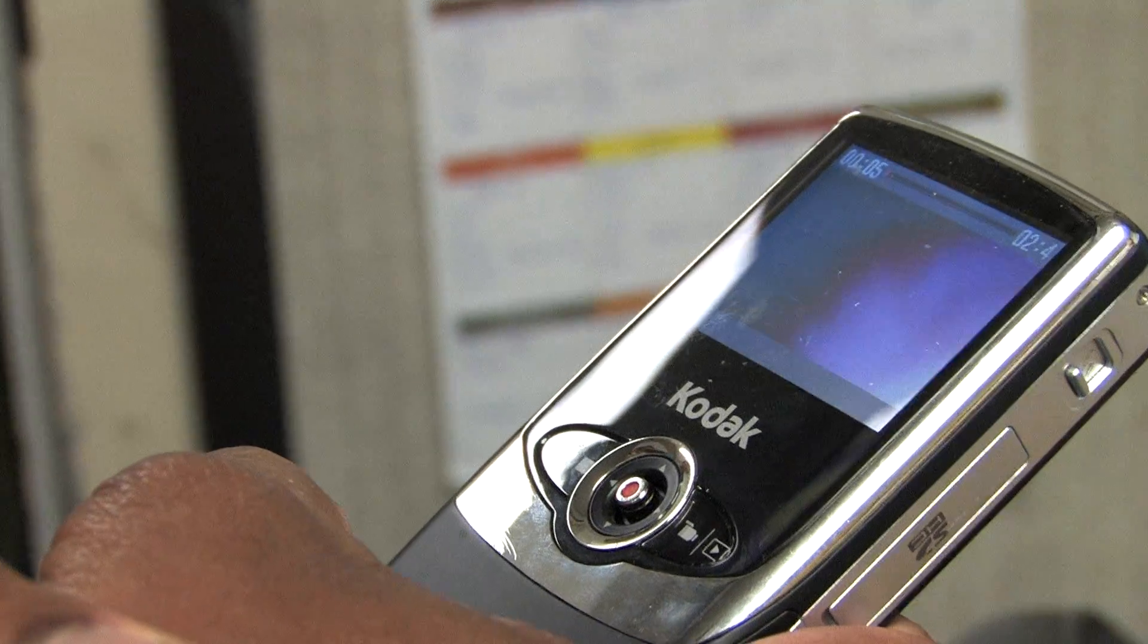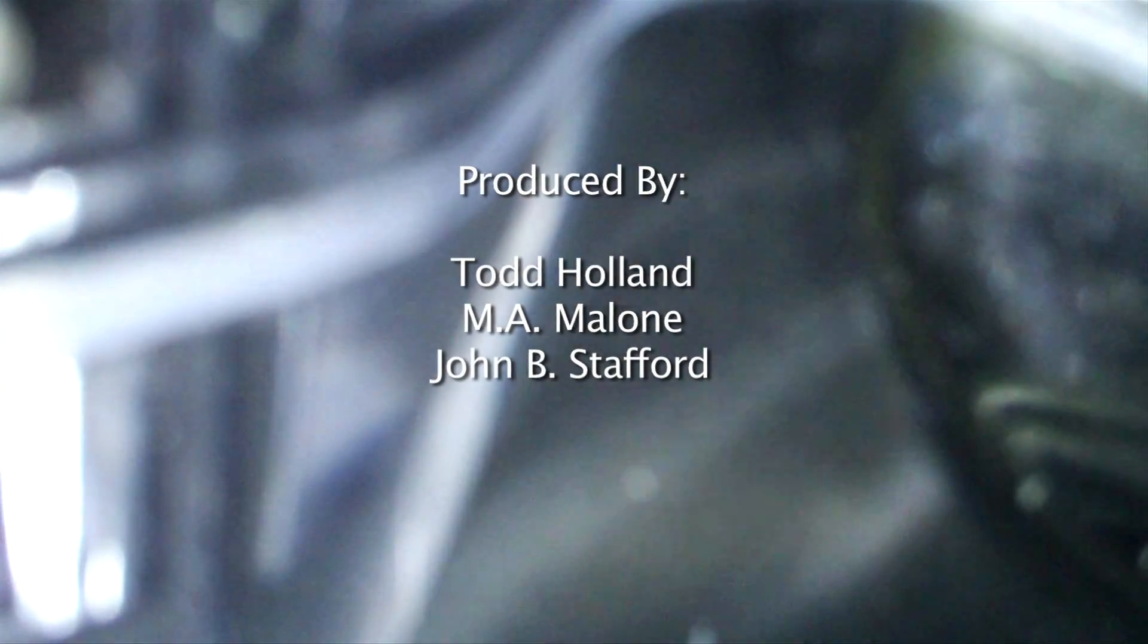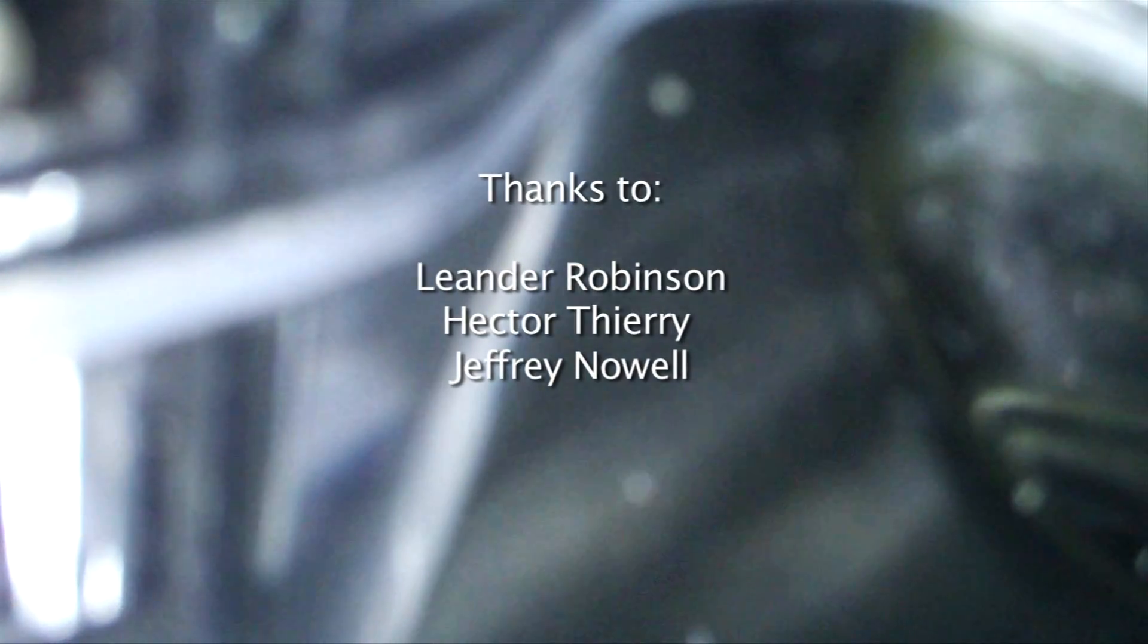You're like a proud papa with a new baby. Am I holding it incorrectly? It's pretty cool. It's pretty clear. The way it sits now, it's like perfect. Here it comes, I'm going to descend, and now here it comes back, here it goes.